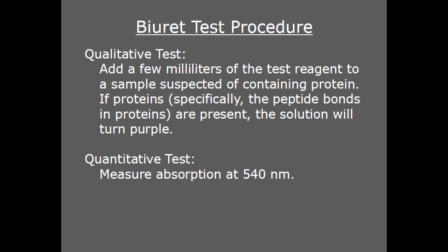Biuret reagent can be used to give a positive-negative test for proteins, or the specific concentration of protein can be determined if you use a spectrophotometer, Beer's Law, and a carefully prepared calibration curve. In this video, I'm just going to show the qualitative test.